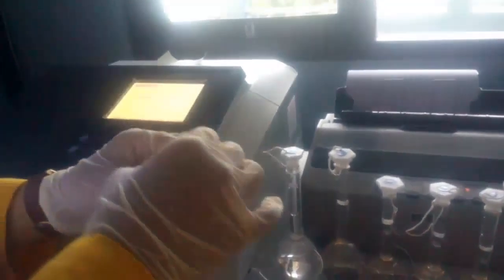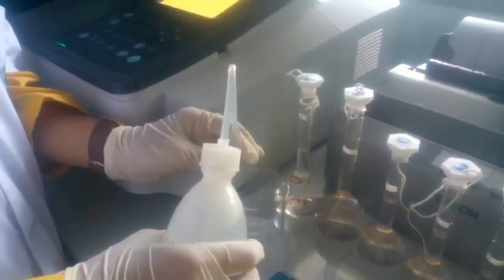Take out the cuvette and wash it off with aquadest.